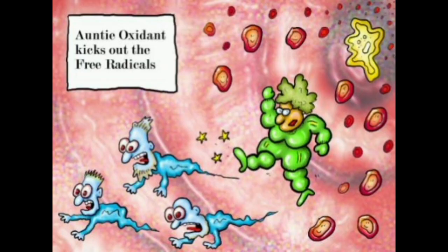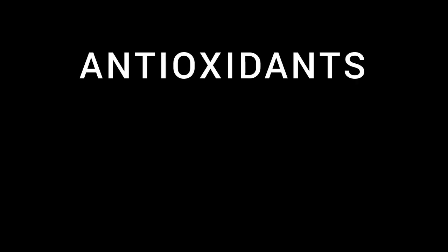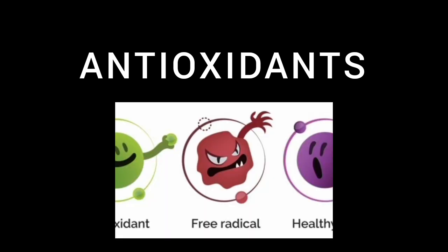So what can we do about it? We can't let it be. We gotta survive. So we need a savior, someone who can sacrifice, and there comes the great hero on the scene, the antioxidant. Antioxidant is like Commander Safeguard, the big brother. It goes to the free radical and says, hey, you free radical, you're so restless, huh? Let me put you at ease. Give me that unpaired electron of yours and you go have some rest. Get done with this chain reaction of yours. So what it does is it scavenges. It captures that unpaired electron and then they start living happily.